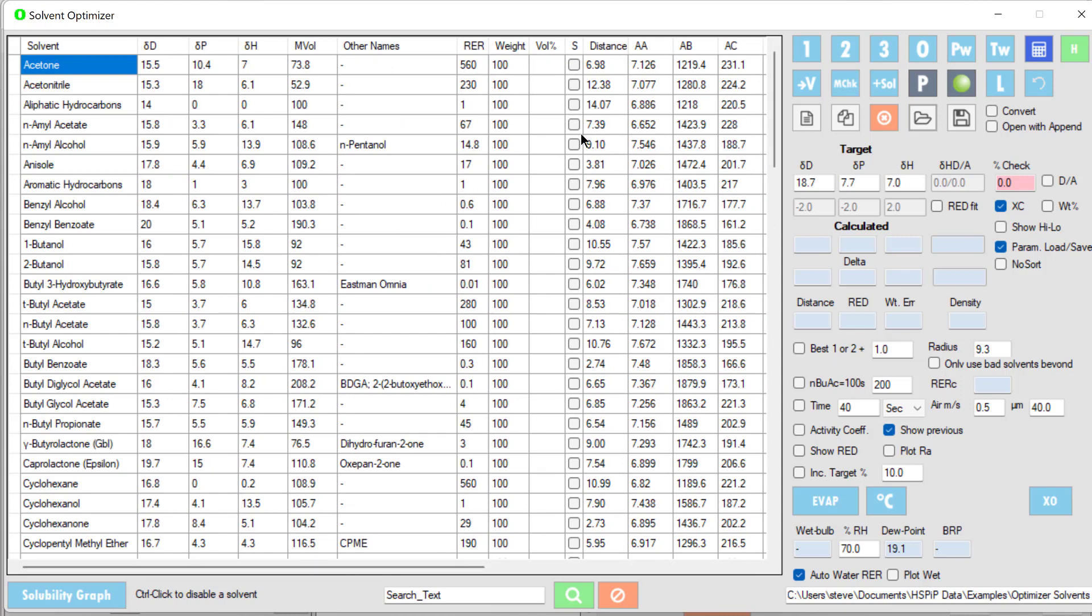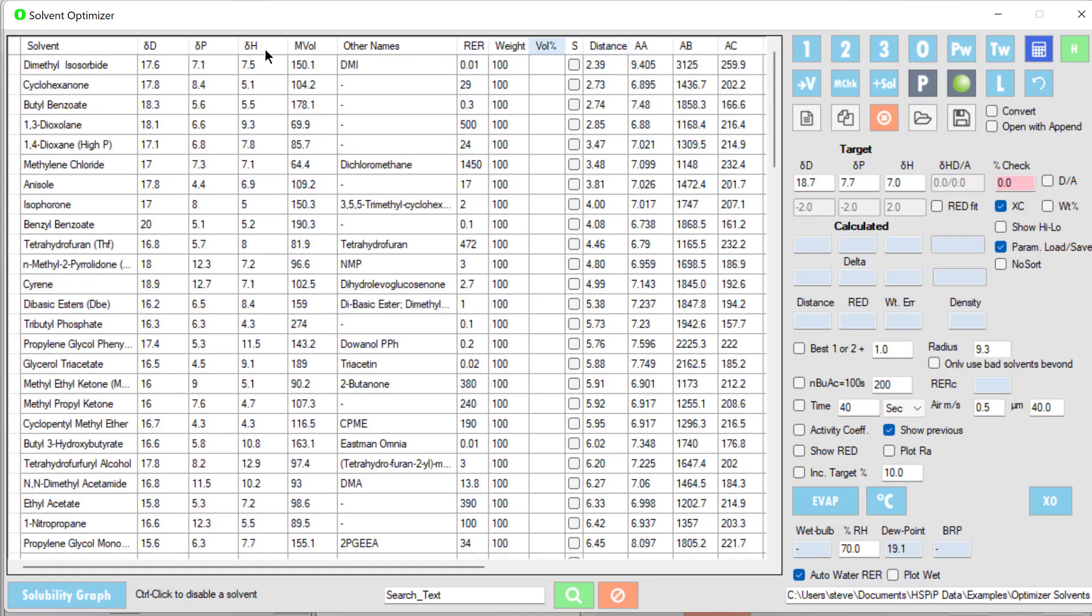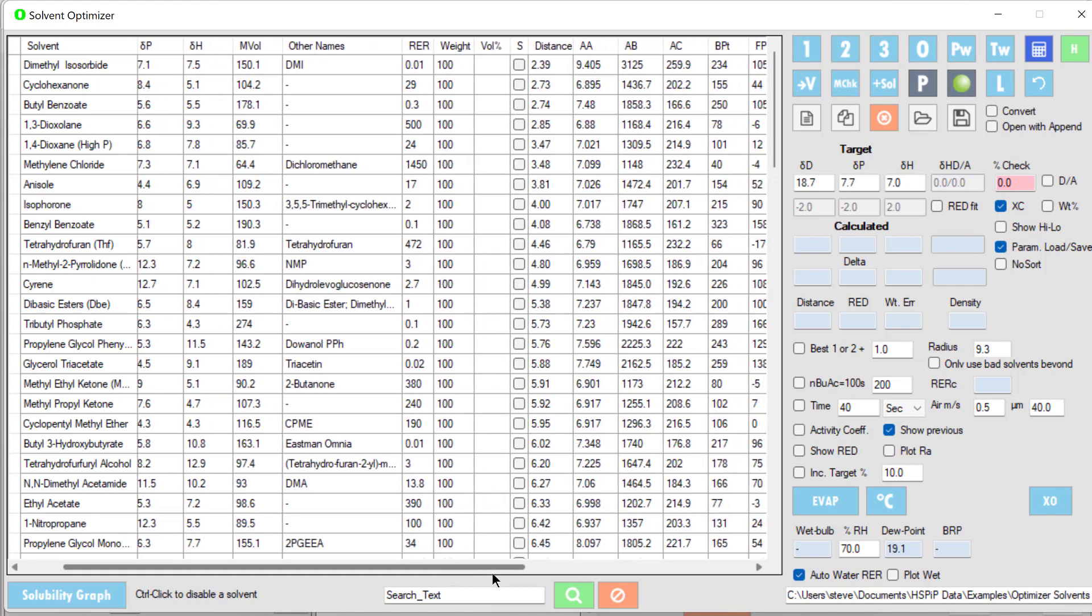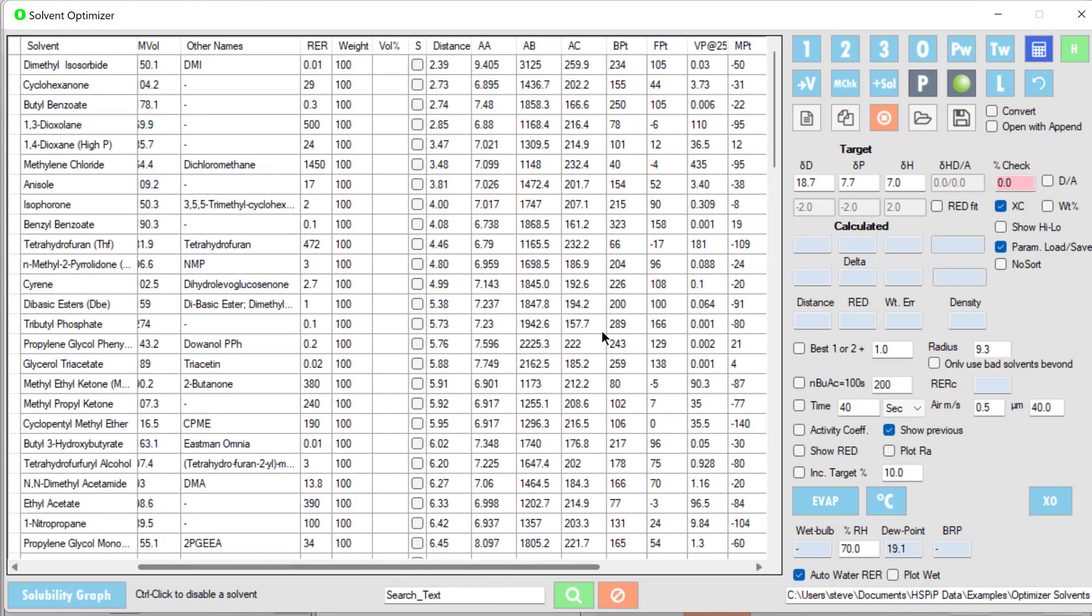We know that a short distance is good, so let's sort by distance. We find that dimethyl isosorbide, a green solvent, is very close but its relative evaporation rate is very low. Cyclohexanone is not bad, quite a good balance and not very toxic. Butyl benzoate is quite green but not very volatile, and dioxylane has a very high RER and very low flash point of minus six, so we probably can't use that.